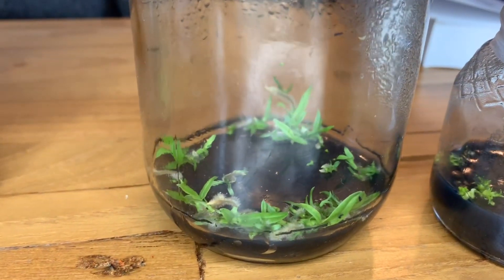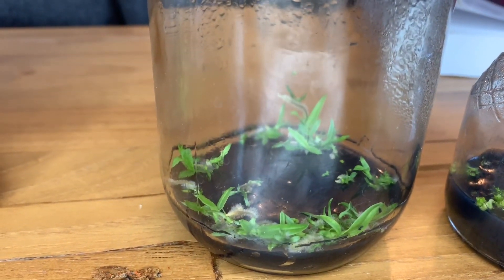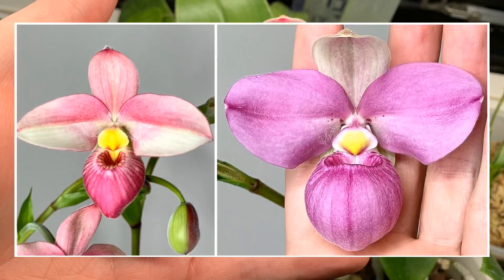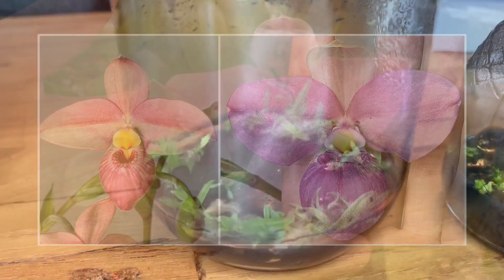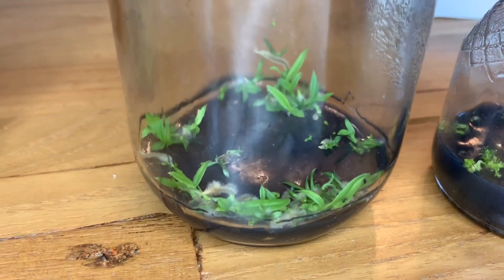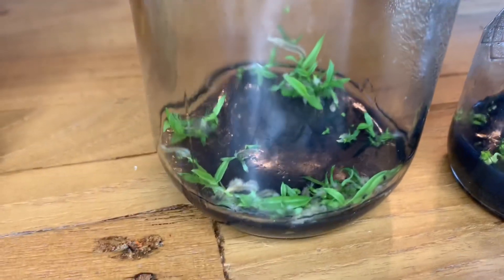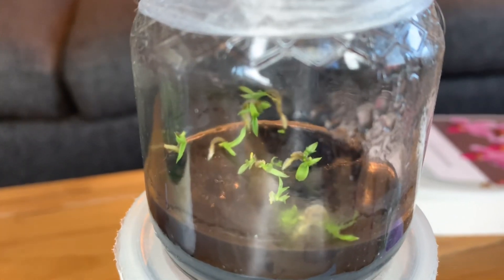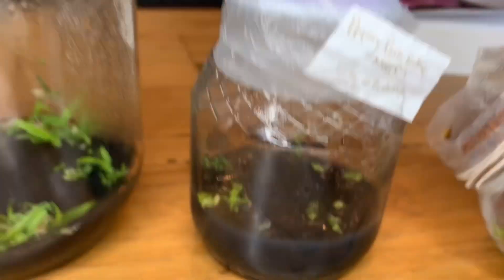These are the Fragmipedium Hane Papao by Sam Crothers. These are doing really well — they're one quarter Cavacchiai. I'm super excited for these because they have a lot of vigor. That's about the only reason why both of these flasks have done really well. I can't get to focus very well inside there, but I'm very excited for those.